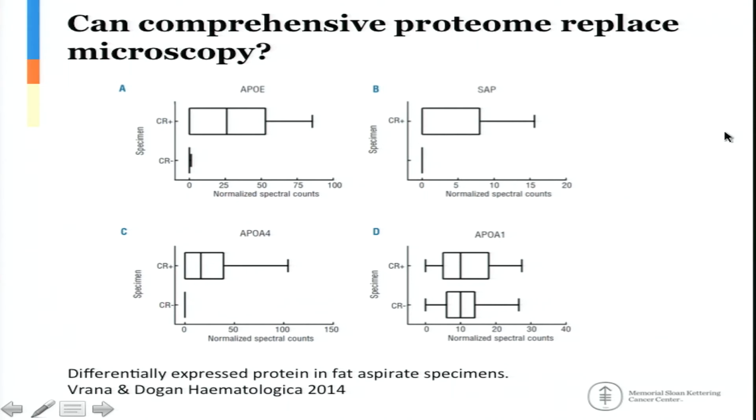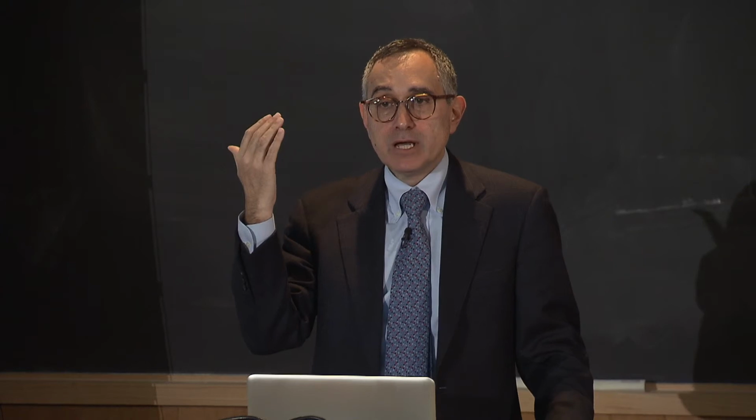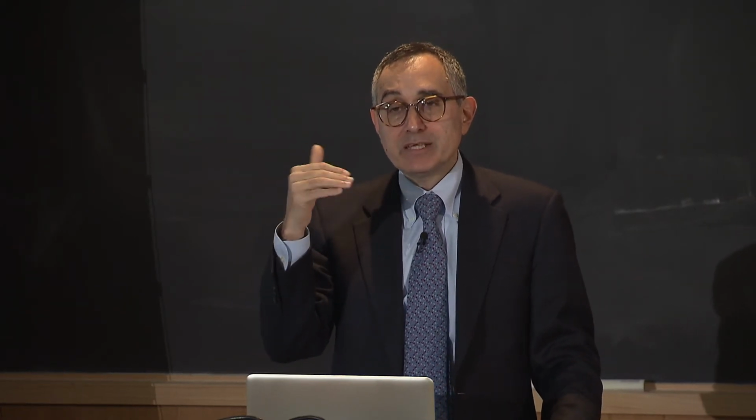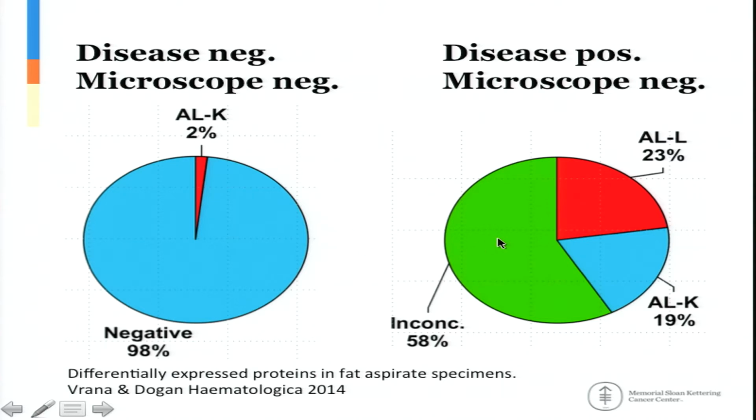And interestingly, of course, when we compared the results with the histology, there was only one false positive case. This is a blind assay, so the patient had no amyloidosis, but was a myeloma patient with a very high level of kappa. So we called it kappa based on the proteome, but actually it was coming from the serum. But the most interesting thing was, we don't use this as a clinical tool. Of course, at the moment I'm talking about research.